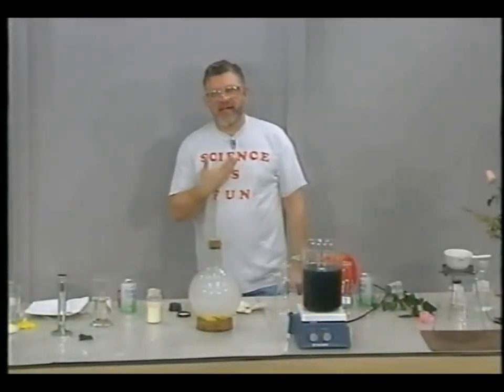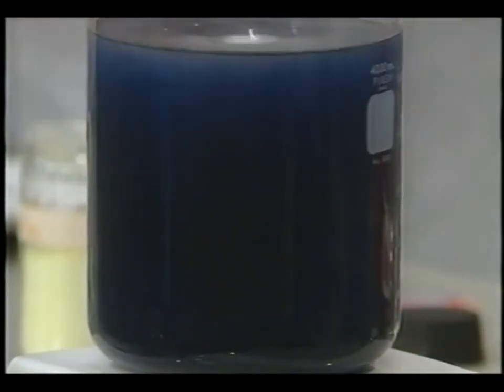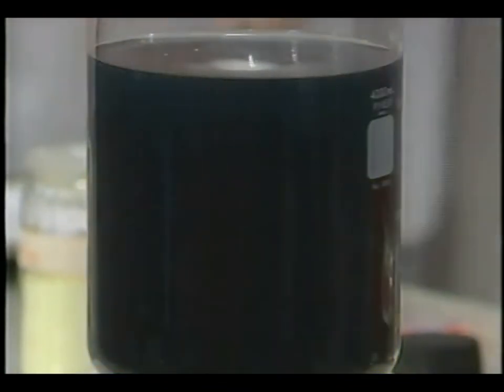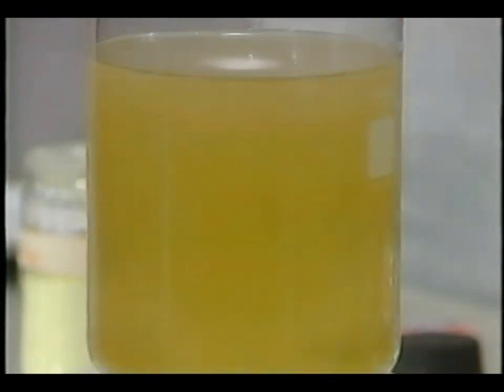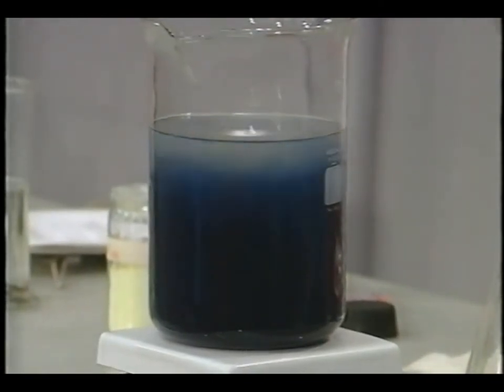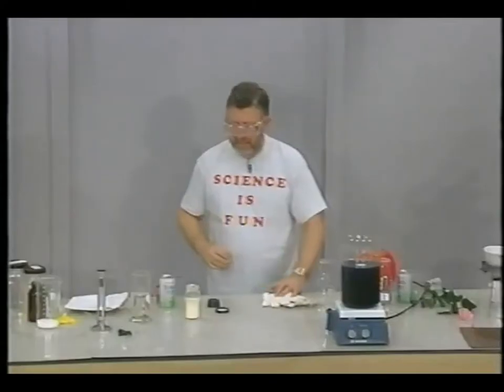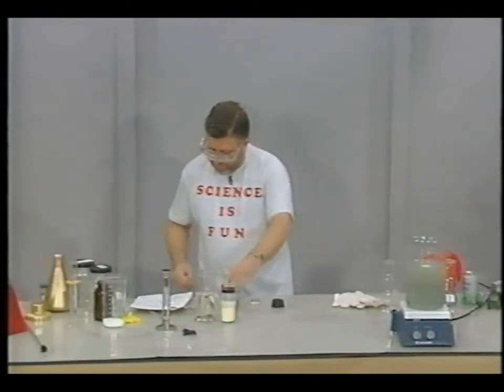This is an example of what we call a chemical oscillating reaction. The mixture that we have there has in it 8 or 9 different components, like water, potassium iodate, sulfuric acid, manganese sulfate, potato starch, and this beautiful sequence of color changes is fascinating. That is what attracts us to science. That is why we spend a lot of time doing science and doing mathematics, trying to explain this very beautiful behavior that is taking place in this chemical oscillating reaction as well as in other systems.